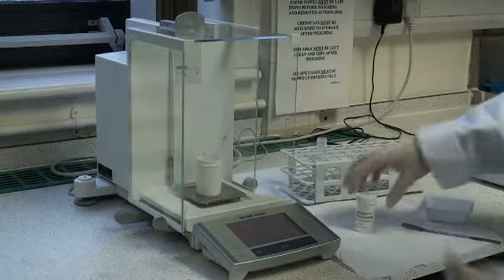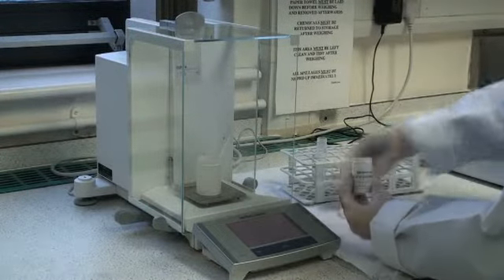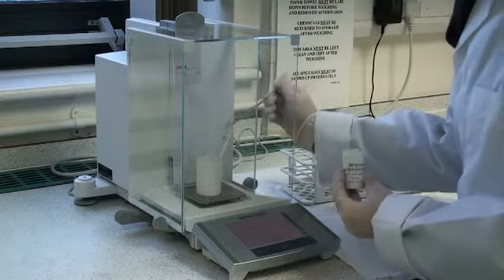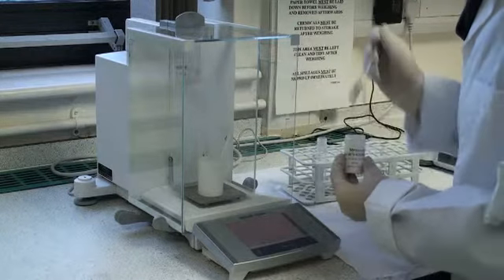Accurately weigh 0.5 grams of milled malt sample into a polypropylene tube or a glass tube, approximately 17 ml capacity.